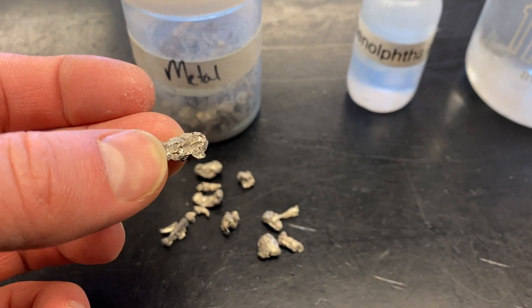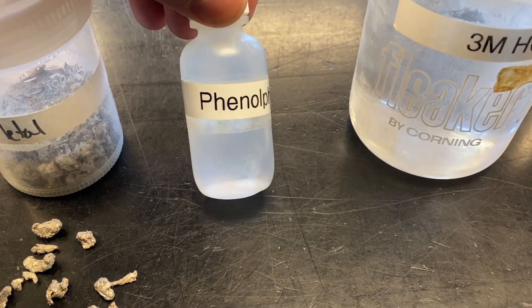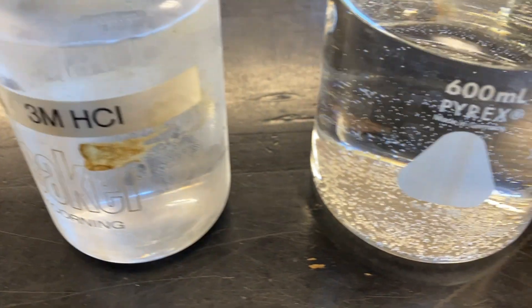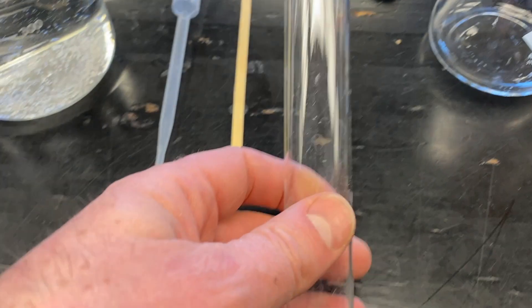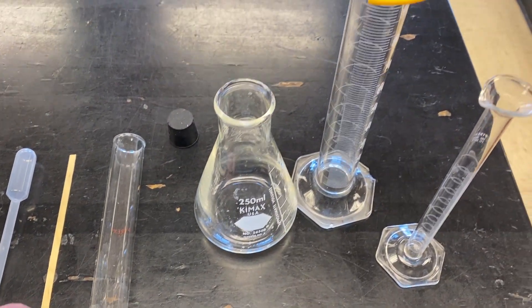In this experiment we're going to see three different reactions happen. We're going to use calcium metal and phenolphthalein — that's a great spelling word in my chemistry class. We're going to use hydrochloric acid, three molar, which tells the concentration. I've got some warm water and then just some chemistry supplies: some pipettes, a wood splint, a large test tube, an Erlenmeyer flask, and a couple of graduated cylinders.